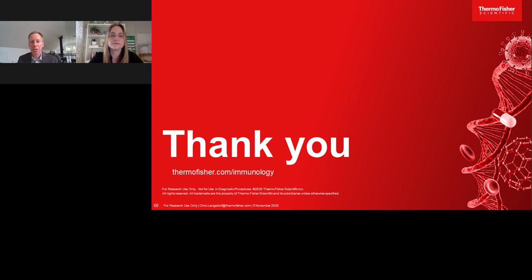Because red blood cells are such a large fraction of your whole blood, you really need the throughput of the Attune to make this a practical assay so that you can actually analyze enough cells in a reasonable amount of time, especially if you're doing a dose response curve or something like I showed. So yes, it's definitely possible on other instruments. It's just much more practical if you have access to an Attune.